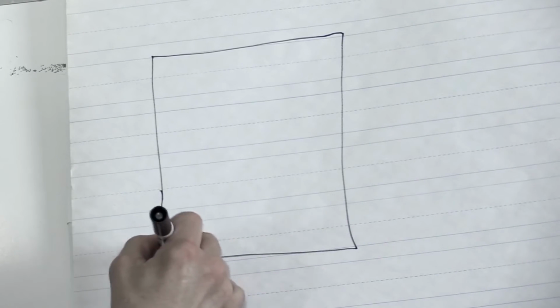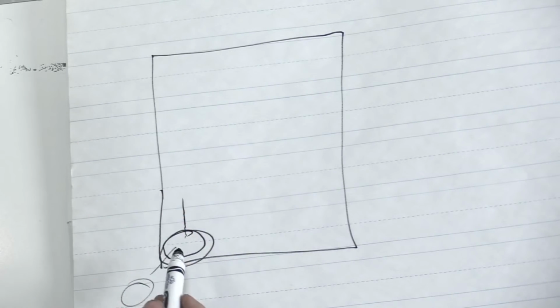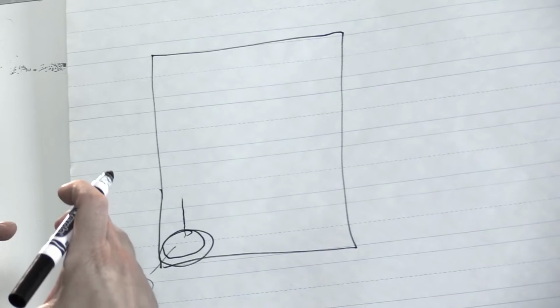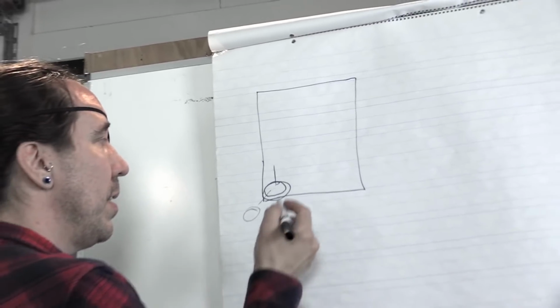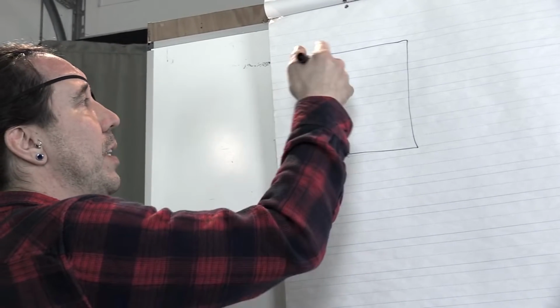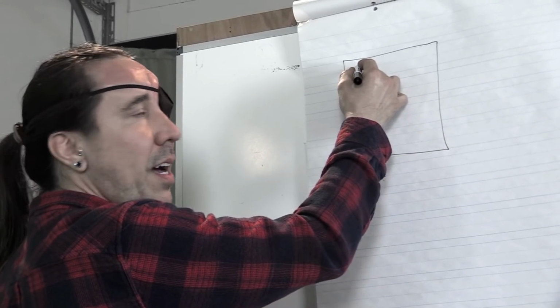So I'm looking for nematodes, and I slowly scan. I'm moving my point of view up this way. Very slowly in the microscope, I'm just moving up, and we can show you how I do this once we get onto the microscope camera. Moving up, looking for that movement, looking for that shape of a nematode. So scanning all the way up to here, didn't see any.